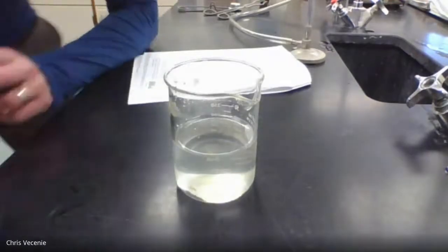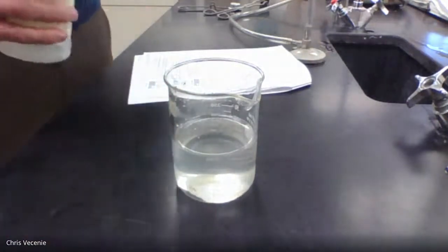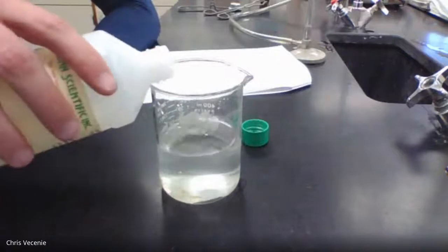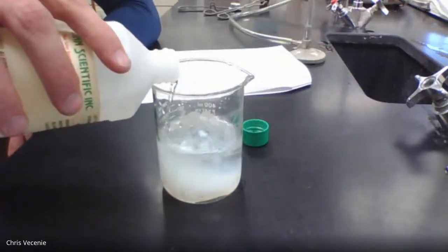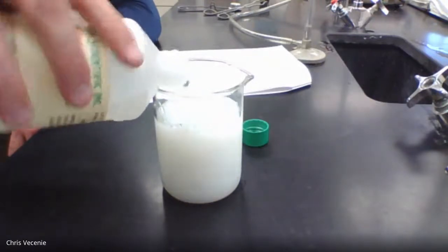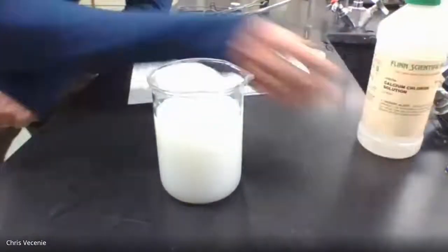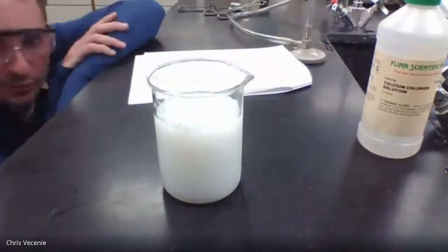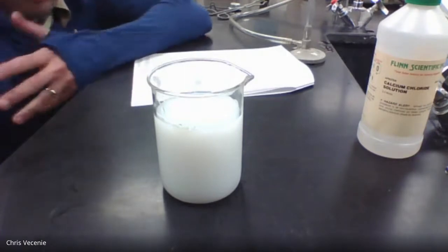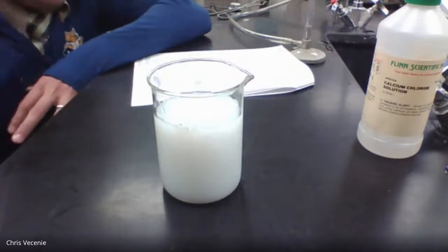All right, so here's my calcium chloride. And I'm going to add it to get about 125 more milliliters. So I'm going to take my 200 up to 325. And sure enough, you can see that this has now become a milky white solid mixture, right? You've got the precipitate in there, but it's sort of spread out throughout the liquid.